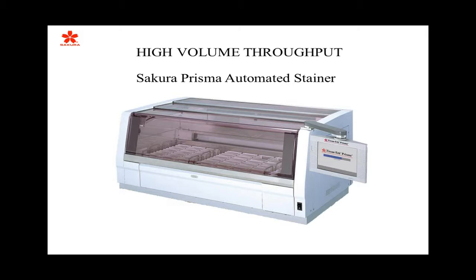Now, the last point that I want to make is that there's been some discussion in the industry over these kind of stainers, whether it's this stainer or the other stainer, and the prevalence of floaters in these systems. Well, most times a floater on your slide will come from either the grossing step or the embedding step.